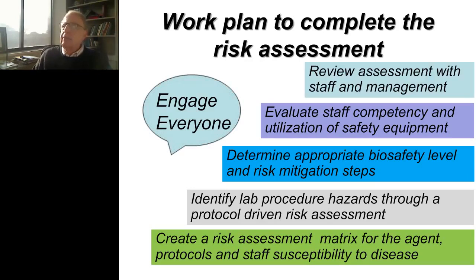And lastly, review your assessment with staff and management. Everyone should be engaged in the process, and reviewing the assessment is really an important part of that engagement. In my laboratories, I've signed off on the risk assessment after they have been performed so that I could be well versed in what staff are performing as the laboratory director.